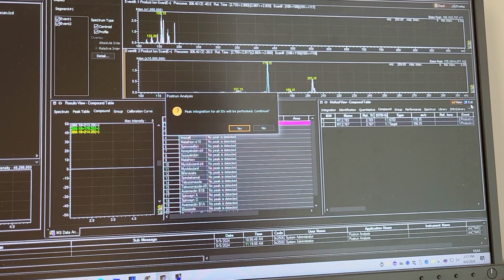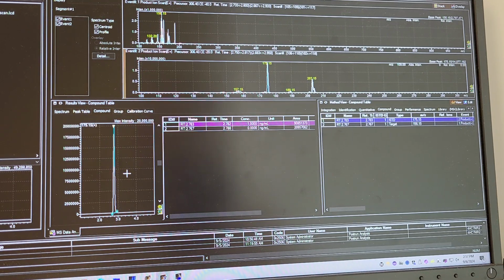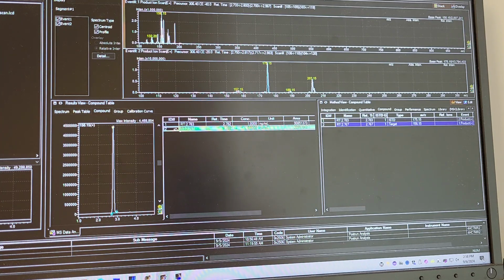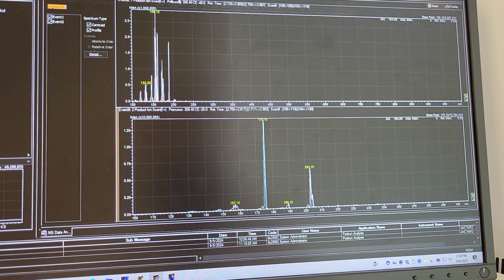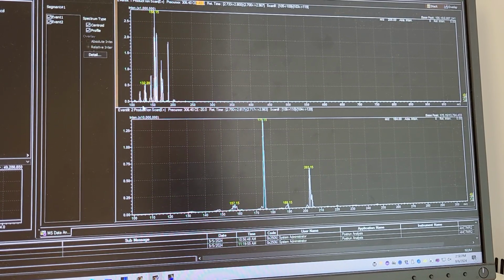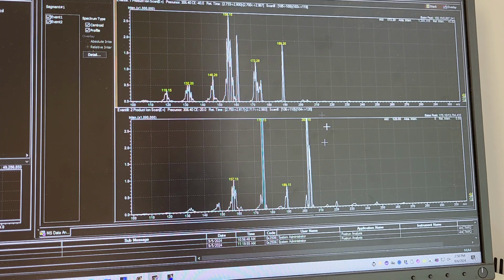After I've edited, I go to view, and the software integrates those peaks. So it looks like this is our bifenazate. I'm going to take a look at this and see what I find. What I'm looking at for this first event is the 40 volt collision energy, and I had scanned the entire range of M over Z from 100 to 1000. But as I mentioned, I don't think anything was going to show up that has a greater M over Z than the parent ion, so I'm going to change the window to look just here so we can see a little easier.